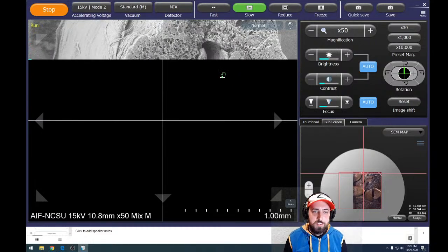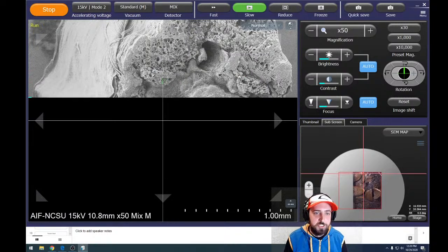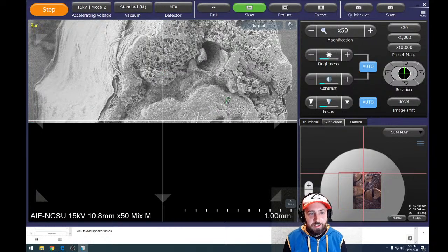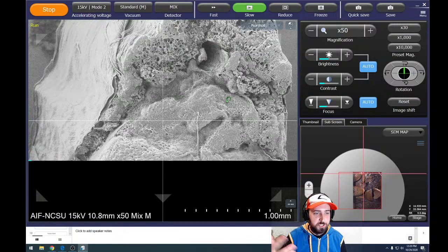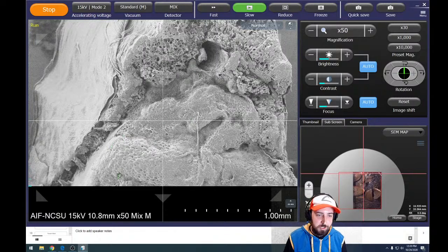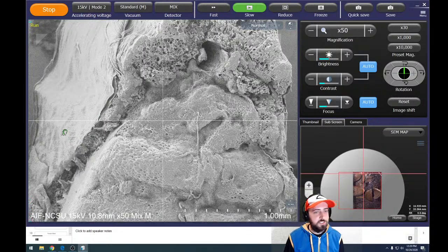So now I'm starting to see a little bit more texture at this top part. And I'm starting to see more features, kind of circles and things like that. I had no clue what I was looking at the first time I put this in. After we let this image acquire a little bit, we'll go in and look more at those things. But I think we're out of the food storage area. And we can also see those lines that were the texture of the seed coat before. So we know that that's the seed coat.